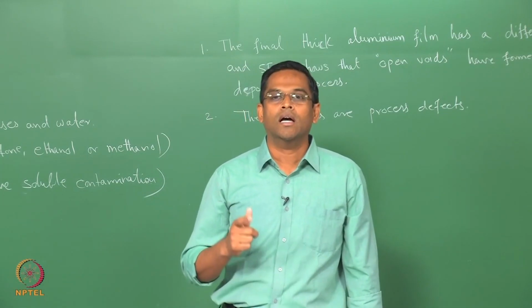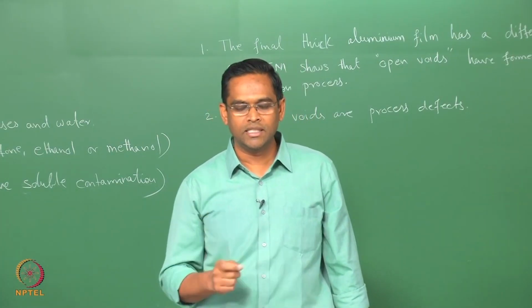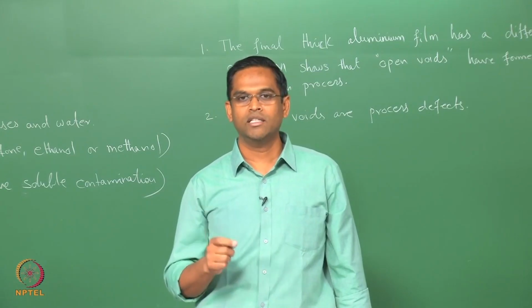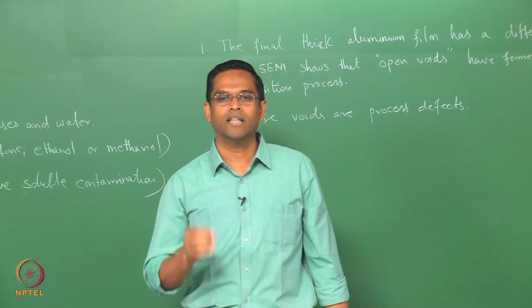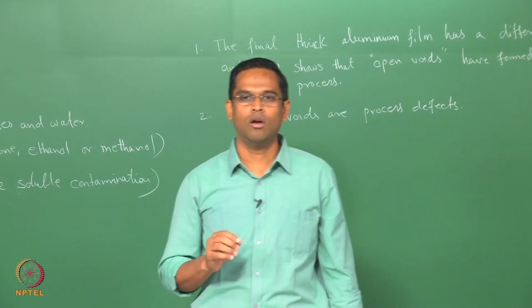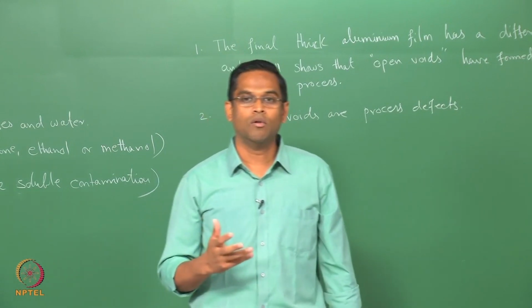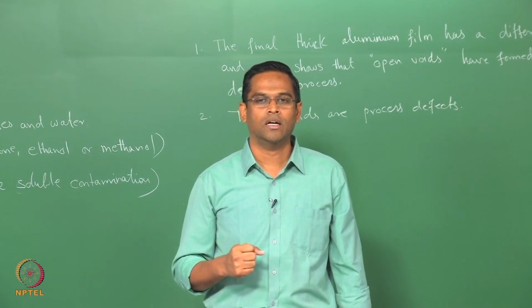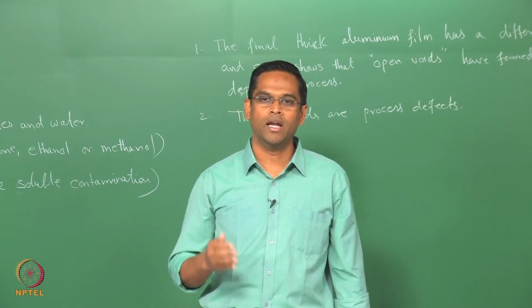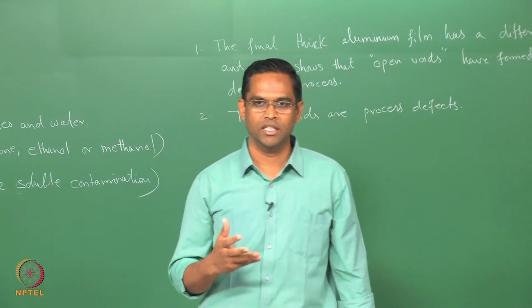Remember, as I mentioned in the theory class, the detection capability of an energy dispersive spectrometer is inferior to another similar technique called wavelength dispersive spectroscopy, where you can have much more resolution of this analysis. You can do similar analysis if you have the attachment with an SEM.